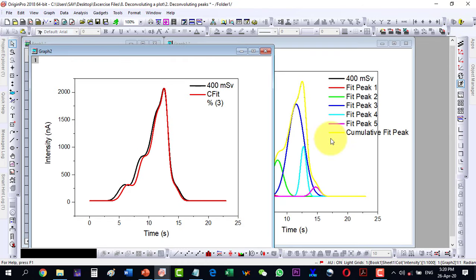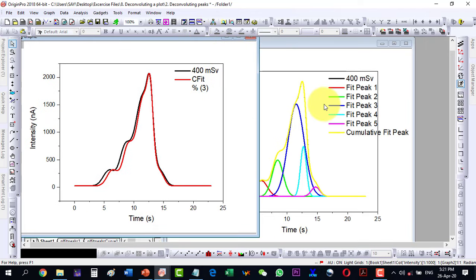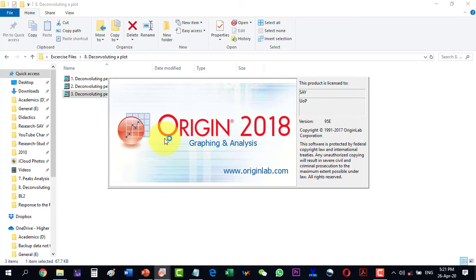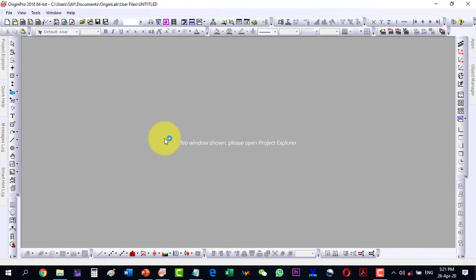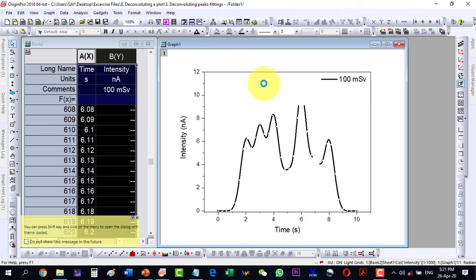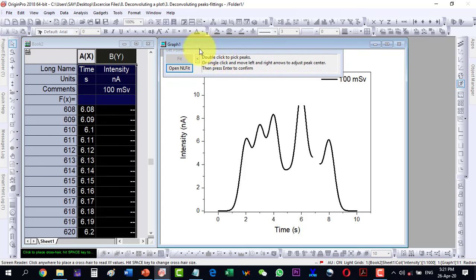Another benefit of this technique is that if some data is missing, we can do a very good fit to recover it. For example, let's open this file. Inside this file we can see that due to saturation we have lost some data, and due to some machine error we have lost other data. A simple single-function fit will not do the job, but deconvoluting it into individual peaks will. I select the plot, go to Analysis, then Multiple Peak Fit, Open Dialog, select Gaussian fitting, and click OK.